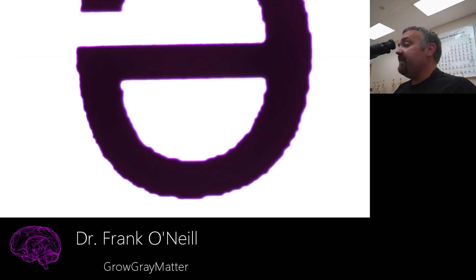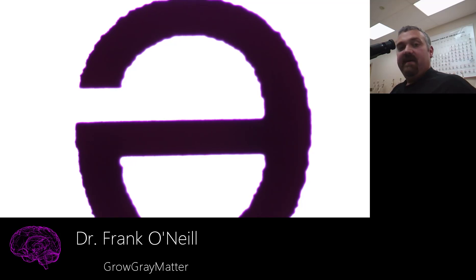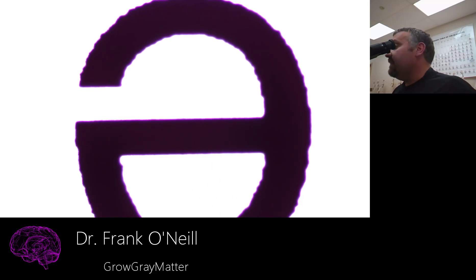As I then jump to the low power, as you can see here, I'll get her tweaked a little bit and moved, but you can barely see the entire letter E here. And that's because as I just jumped from the 4x objective with a total magnification of 40 to the 10x low power objective with a magnification of 100, my magnification went up 2½ times. So my field of view is now 2½ times smaller.